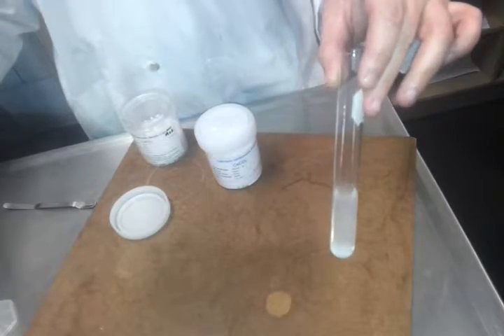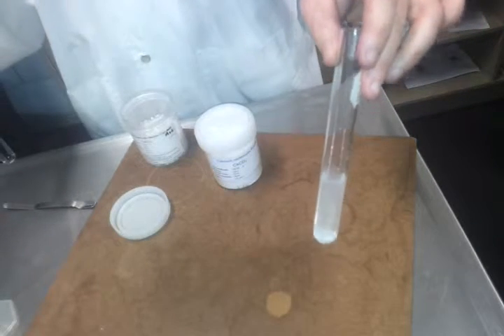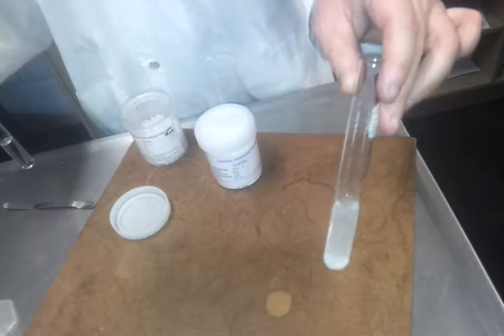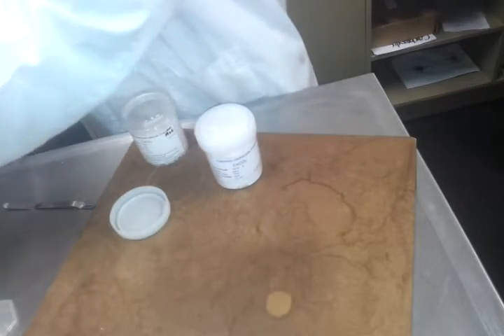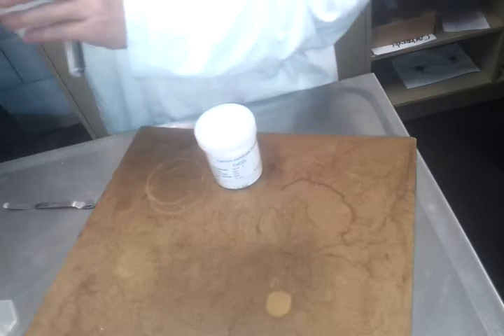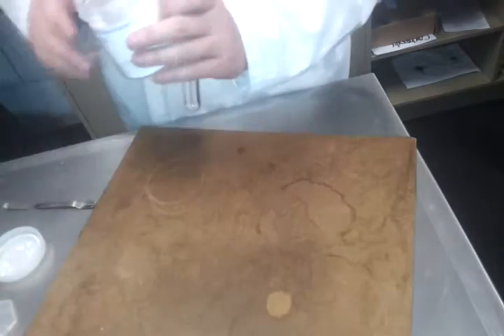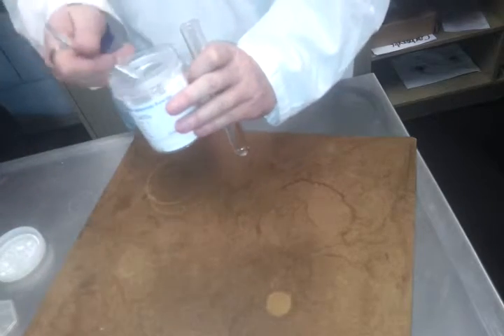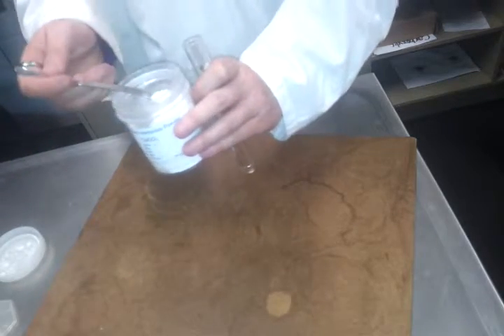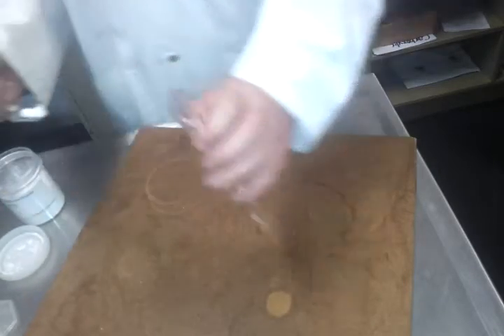Take note of how quickly that's happening, so the rate of reaction, because the collision theory is all about why do things react, but also why do they react at the speed they do. Now I'm going to take about the same mass, roughly the same mass as a powder, which would be a decent spatula full. So that's probably about the same mass as we had.